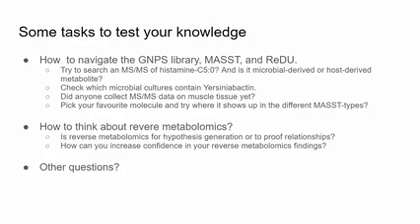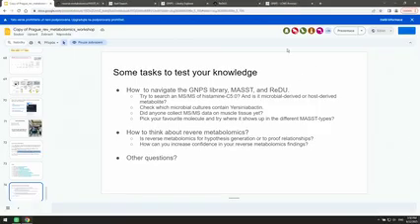Oh, yeah, it's here. Do you have the files easily accessible? I think you might need to just stay here to upload. They're on the GitHub, right? Or do you have them on your computer? This is not my computer, so I don't have the files.